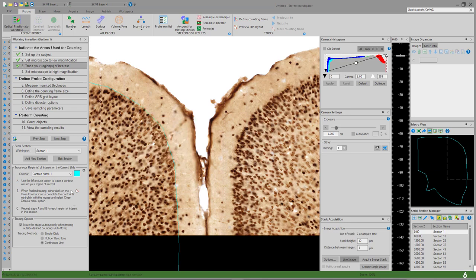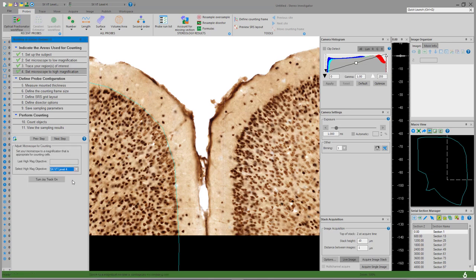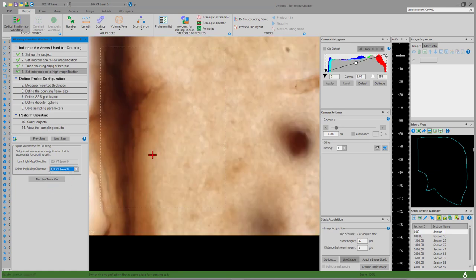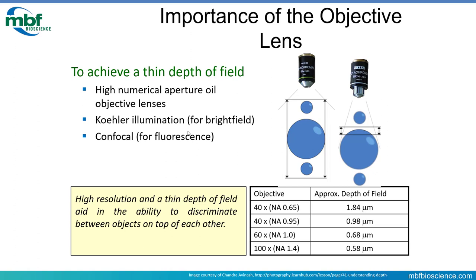In the workflow, we could trace additional regions of interest on this section or additional sections, but let's proceed to the next step. The next thing is to go up to high magnification — typically the highest magnification objective on your system, which almost always means an oil objective. Do I really have to use oil with a 60x or 100x? It's a mess, gets everywhere, smudges objectives. Do I really need oil? Oil can be a pain to work with, but it's actually worth it and extremely important in order to do unbiased stereology and get results you have confidence in.